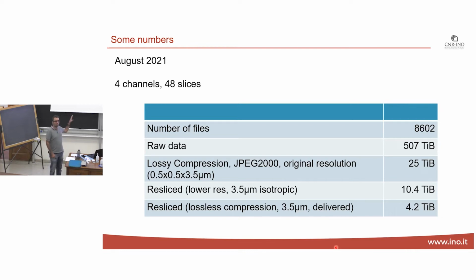These are lossy algorithms, okay? Like MP3, for example. MP3 throws away those frequencies that mostly we can't hear. So at the end, the visual result is still pretty good, even though the data set size is much smaller. So basically what we throw away is noise or background, basically.